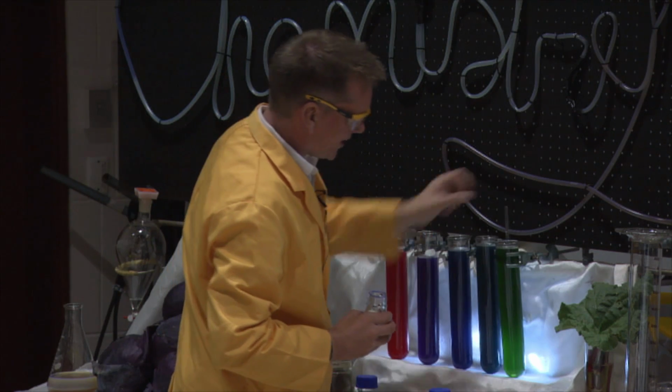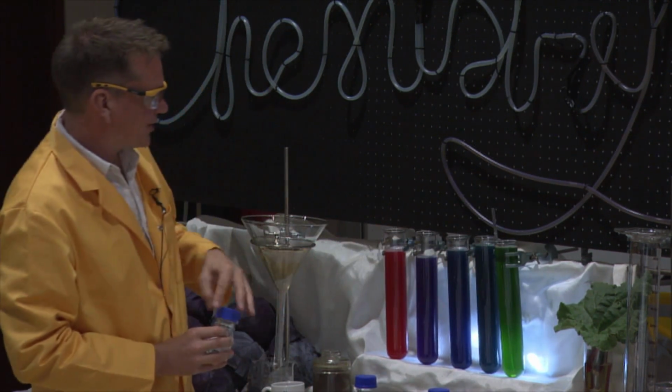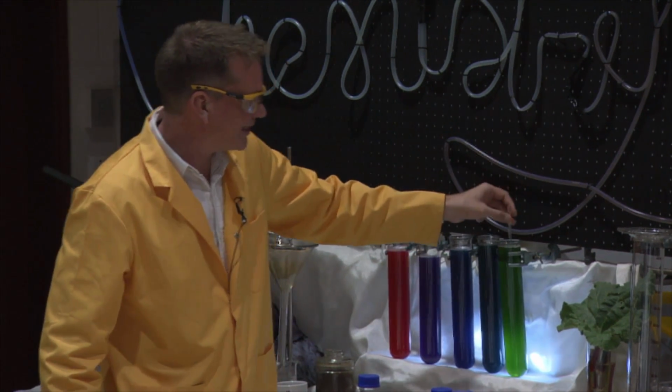So this is certainly quite light green to start off with, and I'm hoping that if we just leave it a little bit, it might go actually quite yellow. So we'll have to keep an eye on that one and see what it looks like in a little bit. It's certainly getting lighter and lighter.